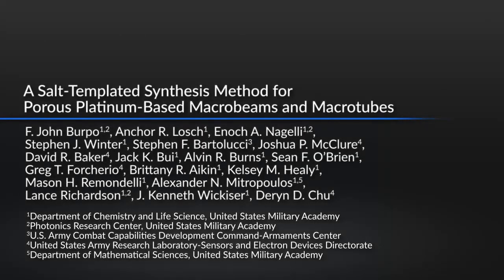This protocol offers a simple, relatively fast method for synthesizing high surface area, high aspect ratio platinum and platinum alloy macrobeams and macrotubes with a square cross-section.